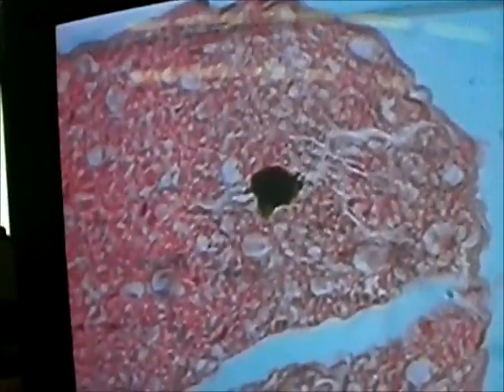And you can see the whole context of the structural arrangement. Black dots are glial cells, you said? Well, those look a little large. I'm not sure what those are. Let's zoom up on it a little bit. I'm not sure what those things are. Those are much bigger than cells. Those look like probably maybe drops of blood or just artifacts. They don't look like anything. What were you saying, Mike? Oh, glial cells? Yeah, the glial cells.